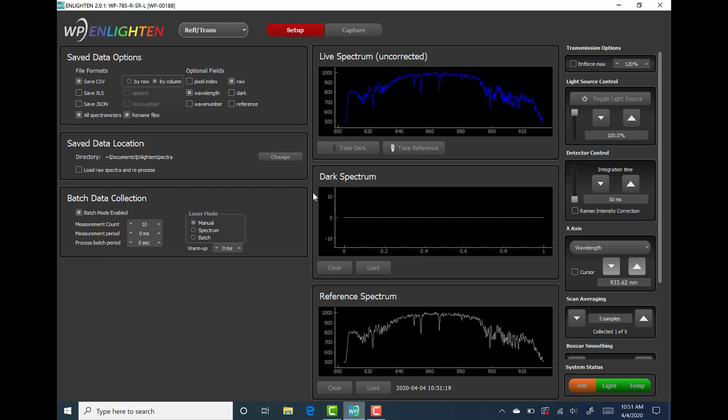If measurement settings have yet to be determined, it's okay. Just like collecting darks for Raman measurements, the reference measurement can be taken and then retaken throughout the optimization process. In fact, it's recommended that the reference measurement be updated frequently throughout the experiments to make sure the illumination light source drift is accounted for.